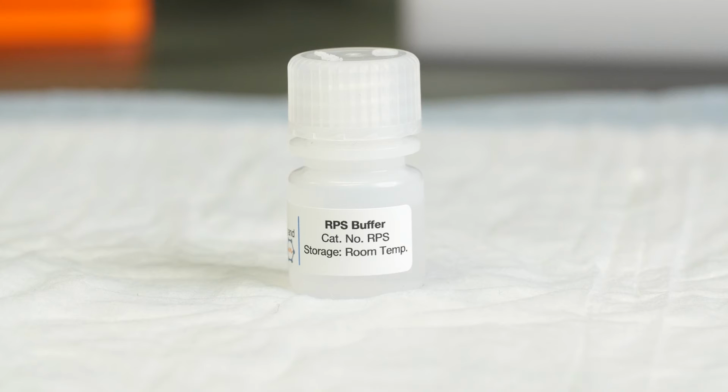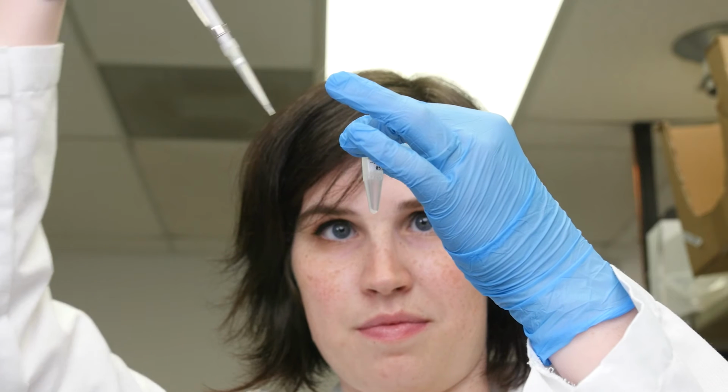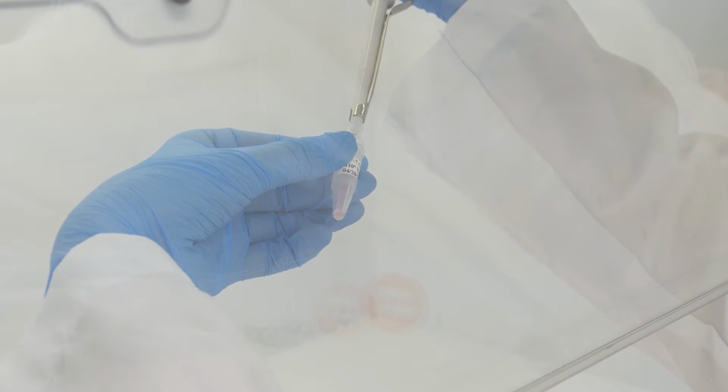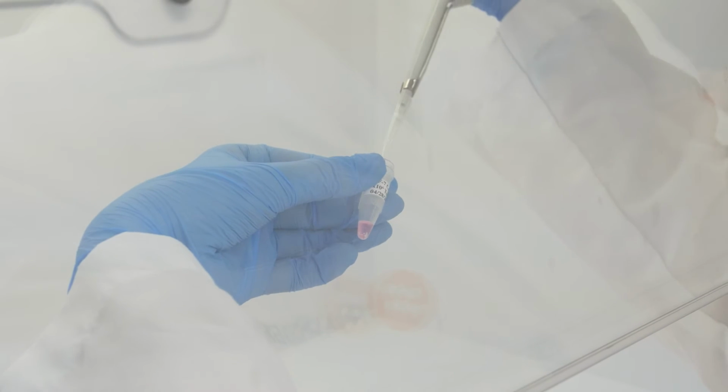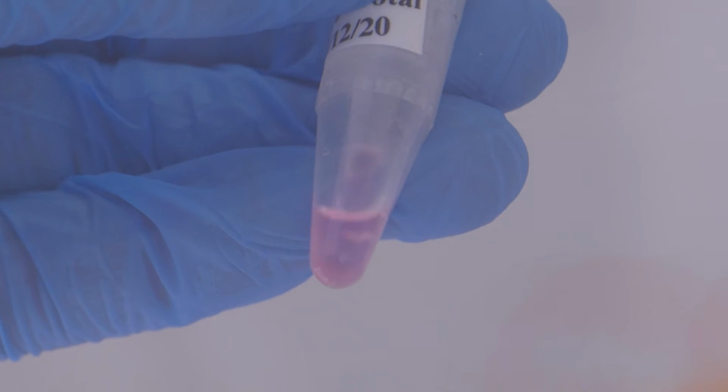Next, we need to lyse the sample. It's easiest to add the calcium and lyse the sample at the same time, so we're going to add 3.5 microliters of RPS, which is a calcium chloride solution, to 100 microliters of lysis buffer. Then we'll add the mixture of lysis buffer and calcium chloride to the sample and mix vigorously. Pipette up and down until the mixture is homogeneous.